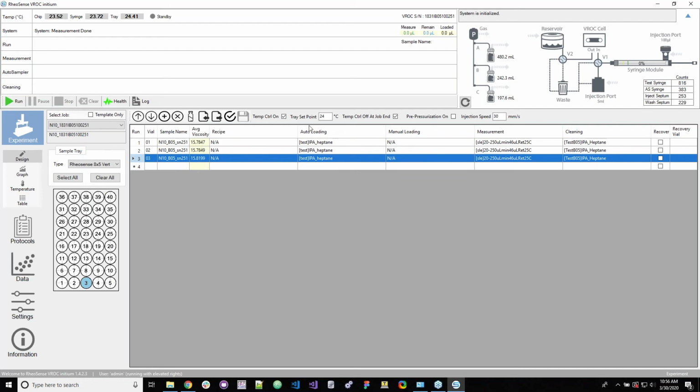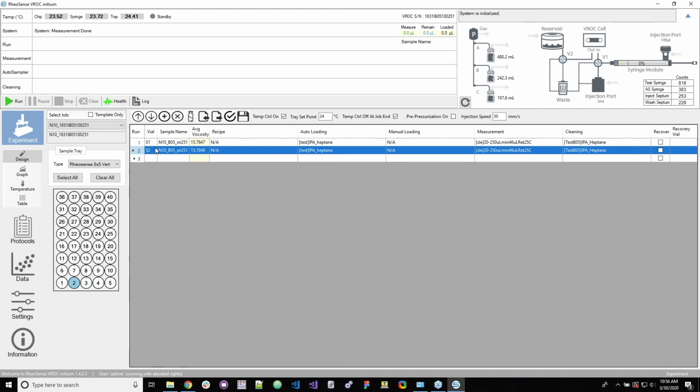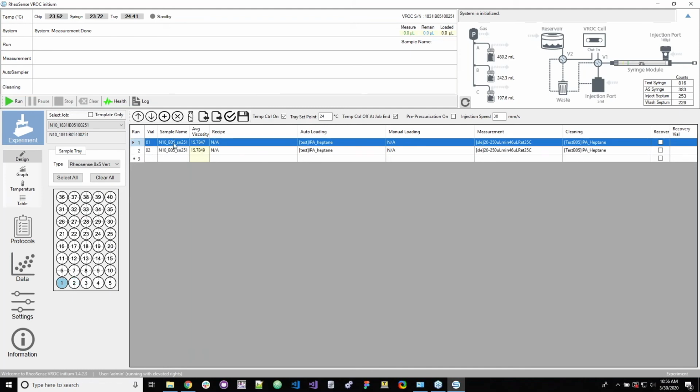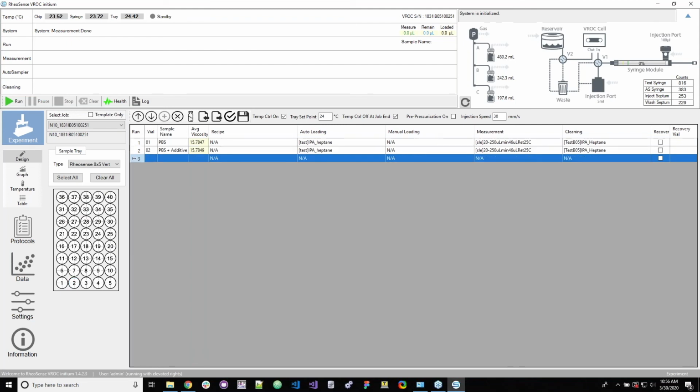So here I have the previous run already saved from the initium. So this is the N10 oil run. So since I have 2 samples, I want to remove one of these vials. So I'll delete this selected row. And so now vial 1 and vial 2 remain. So for vial 1, I'm going to name it PBS. And then for vial 2, I'll write PBS plus additive.